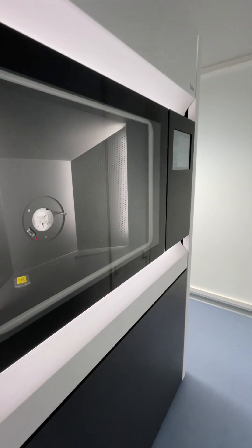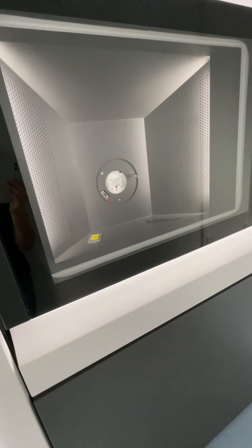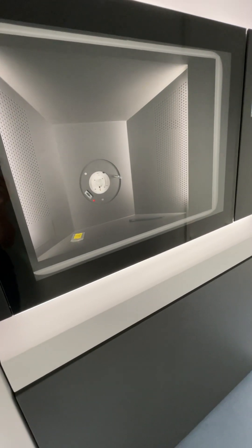Most TEMs that have a separate control room have it right next door, but the setup with this building made this arrangement the most sense.